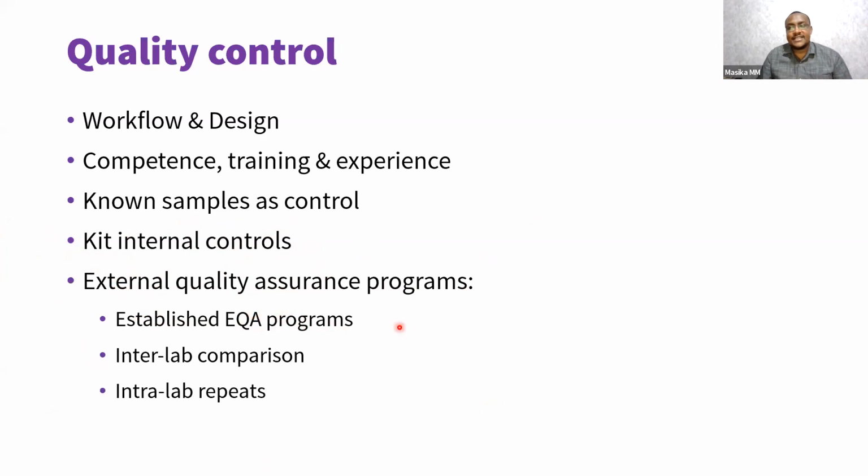So the idea here is, for example, at the Kavi Institute of Clinical Research, you have a research lab, and we are enrolled into different external quality assurance programs, where every 3 months or every month they will ship samples that we don't know the results. And once we test them, we send the results back, then they tell us out of 10, you got 10 or you got 2 or you got 3. Most of the time we get all of them, but once in a while you may get a problem, especially during COVID. There were issues with shipments, or the samples were in bad quality, so we got a lot of false negatives. And so that allows you to know whether you're doing the right thing or not.